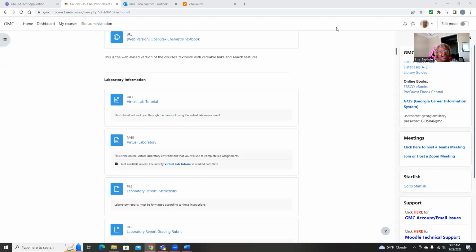Hello, class. I wanted to do this video tutorial to help you not only with the virtual lab, but also writing your lab report. On your Moodle homepage, you have these links. So this is the virtual lab tutorial. This actually needs to be completed in order for the virtual lab to be accessible. So make sure you do go through this virtual lab tutorial.